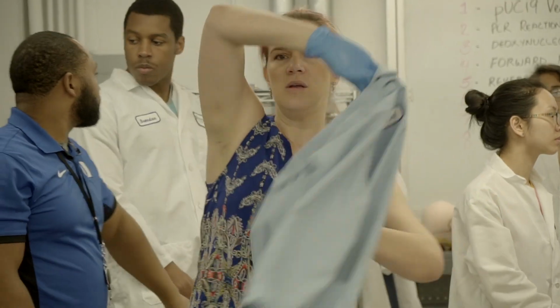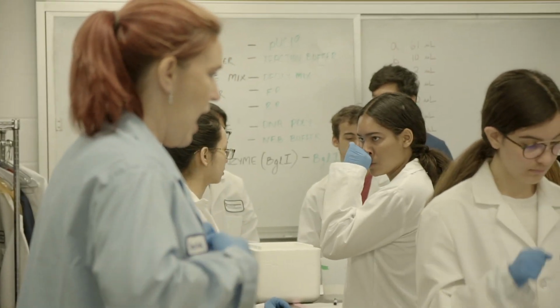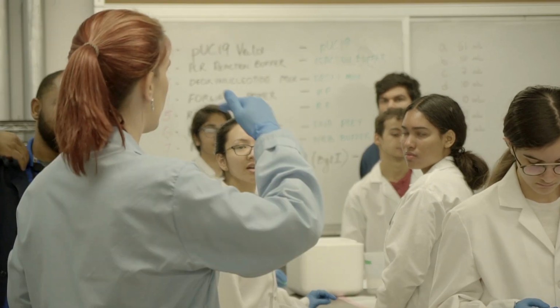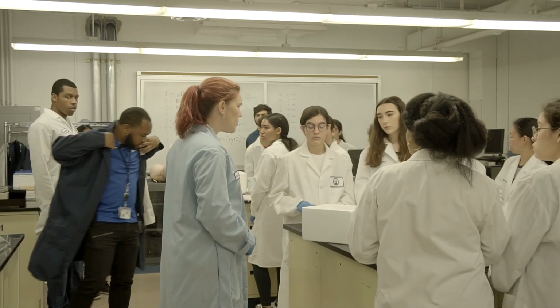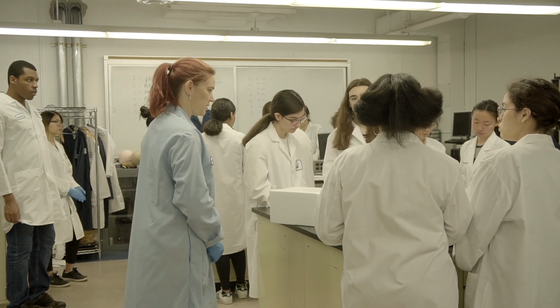All right. So we'll have one of each of us at the bench. You have a protocol in front of you, and it's like a recipe. How many of you have cooked before? Yeah, most of you have cooked. Good. Doing lab experiments is a lot like cooking. You're just following the recipe step by step. One of us will be at each bench to help you as you're going through. Get started. Let's do some science.